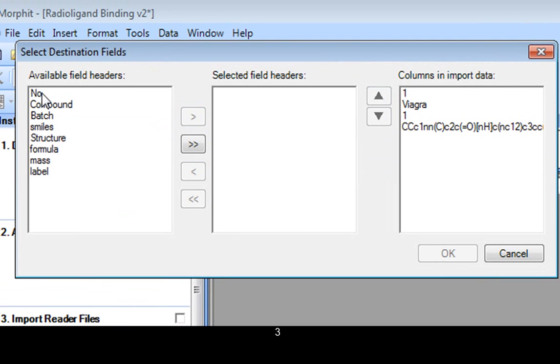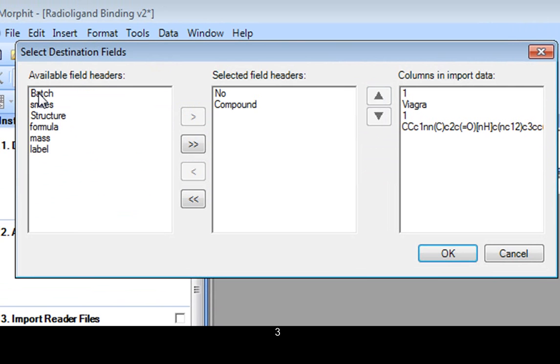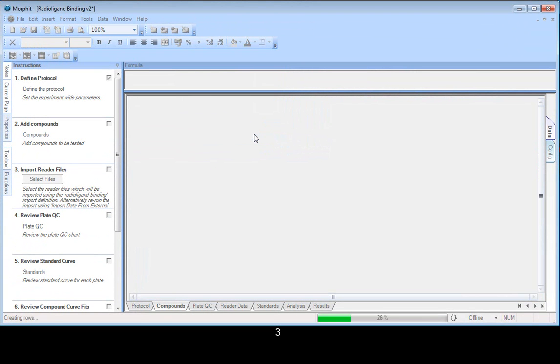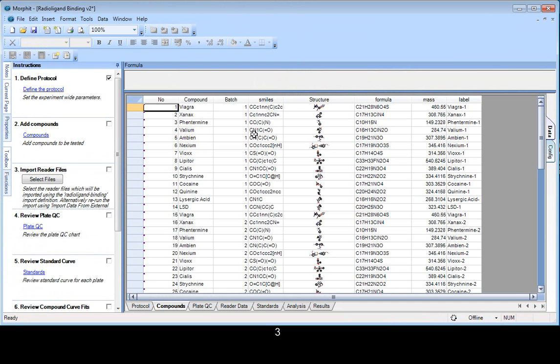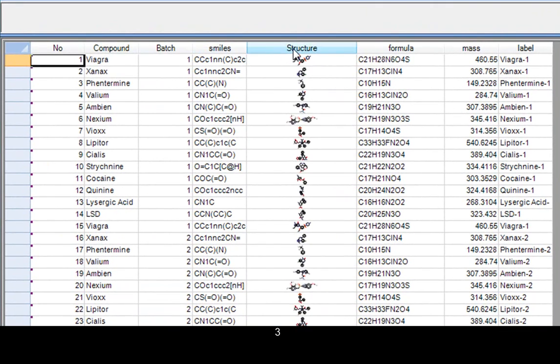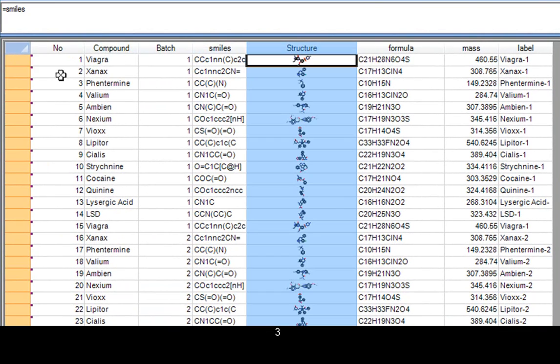And the last step is to match up the fields in the table with the columns in the data file. So we can see the information has been read in, the number, the compound, the batch, and the SMILES. And this has been transformed into a structure.